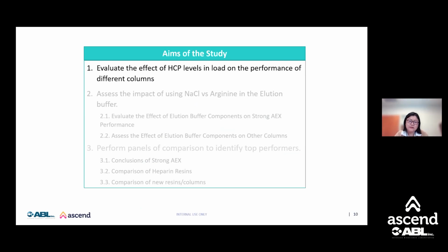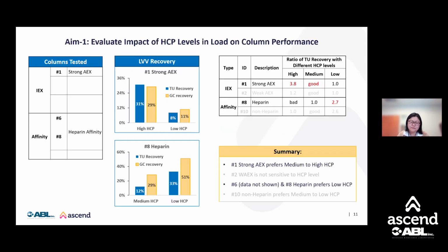The aim one of this study is to evaluate the impact of HCP levels in the load. As expected, our strong AEX performed much better in high versus low HCP. In several other experiments, it also did a good job with medium HCP.